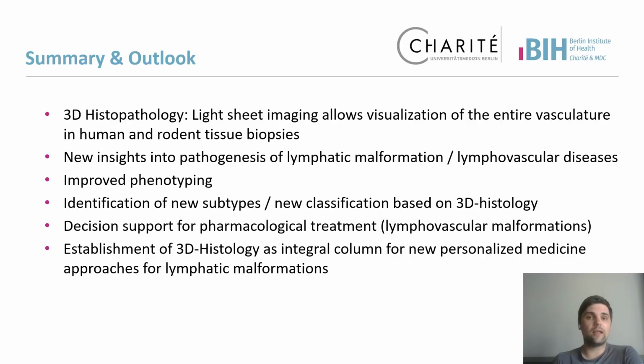And with this slide I'd like to sum up my presentation. I hope I could convince you that light sheet imaging allows visualization of the entire vasculature in mice and men, that it allows us to get new insights into pathogenesis of lymphovascular diseases, therefore provides an improved phenotyping and identification of new subtypes, or even a new classification based on 3D histology, that the 3D histology offers some kind of decision support for pharmacological intervention, for example sirolimus treatment, which I explained to you a few moments ago, and of course the 3D histology will be and can be an essential part in precision medicine for lymphovascular diseases.